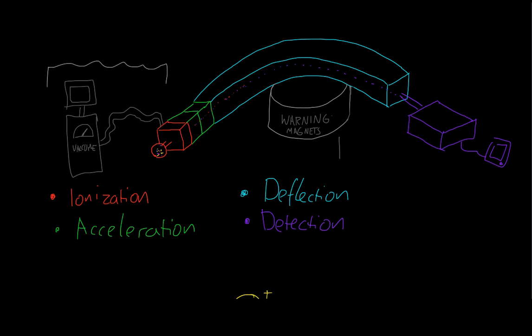So then we change the magnet, because at the moment our other two streams of ions are too heavy and just end up hitting this wall. Like so. But then we change the strength of the magnet so that the next heaviest one, the yellow one, ends up hitting the detector.